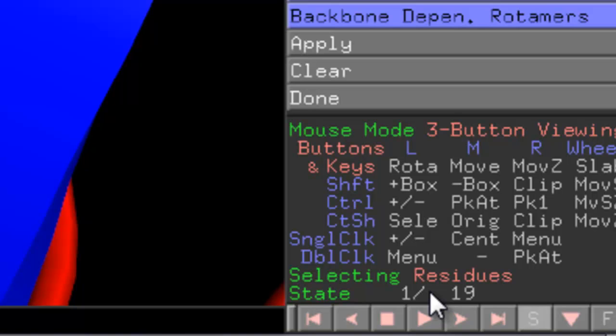So this gets pretty complicated, because if you can imagine the side chain of an amino acid, the more carbons it has, right? Alpha, beta, gamma, delta, etc. The more torsion angles it can adapt to, and this is based on the surrounding residues and other charges in the molecule, and basically a lot of three-dimensional modeling based on the other residues in this environment. I don't particularly want to get into torsion angles and 3D space occupancy at this point. So that's way beyond the scope of this video.